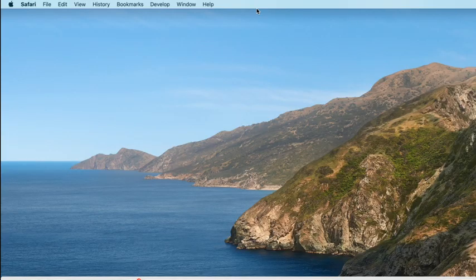So our sequencing experiment, and the information that we've got from the SRA tells us this, was done on a NextSeq 500. So that's an Illumina sequencer. It's been around for a number of years now. In fact, there's a new NextSeq platform that was released in January this year. So the NextSeq 500 has now been superseded. But the NextSeq 500 is a really well-used sequencing platform.